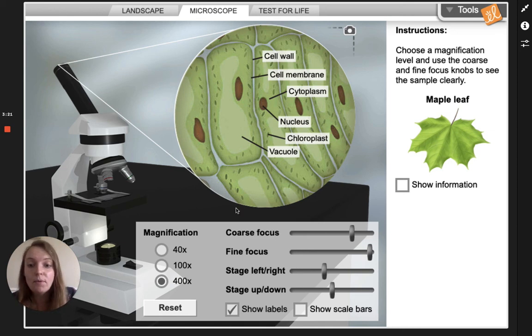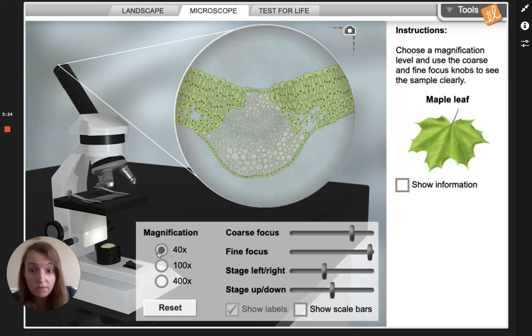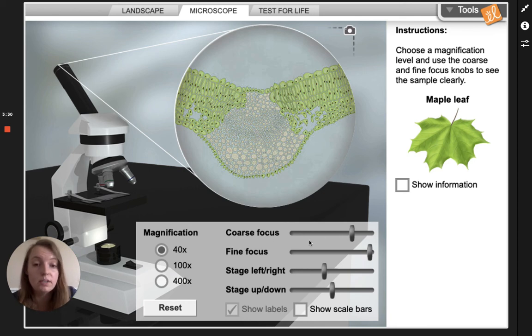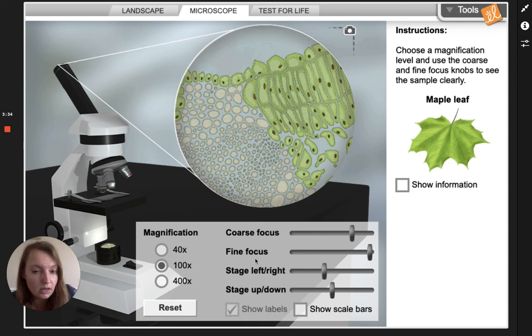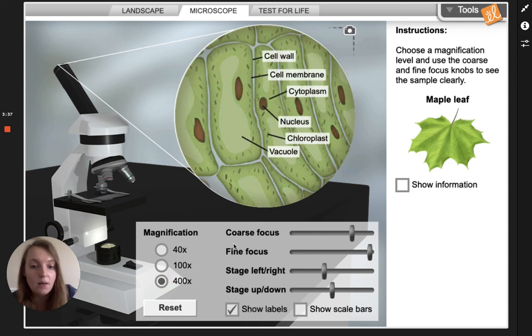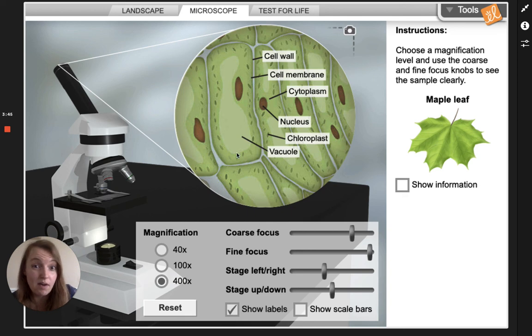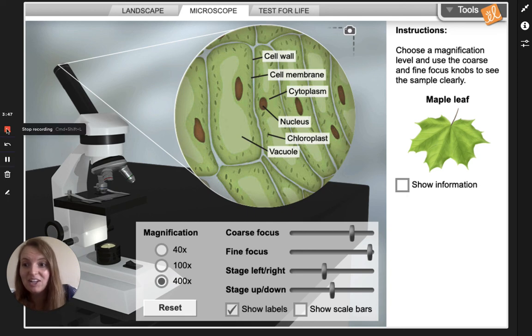In summary: remember we have to start at the 40x and use the coarse focus to focus. Then we can move to the 100x and focus a little bit with the fine focus, and then the 400x with the fine focus to get it nice and clear. Then you'll click show labels to see everything in the cell. Good luck!